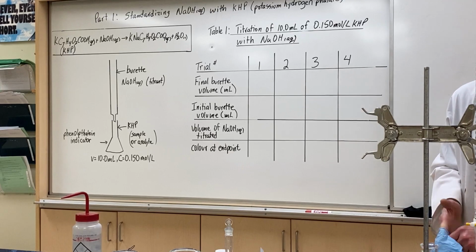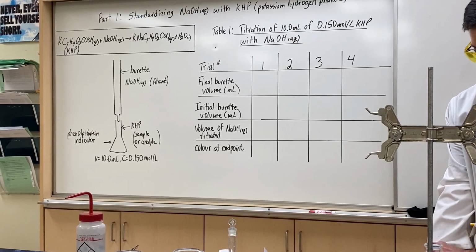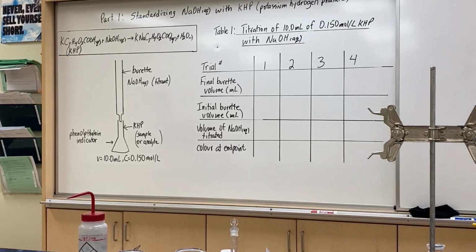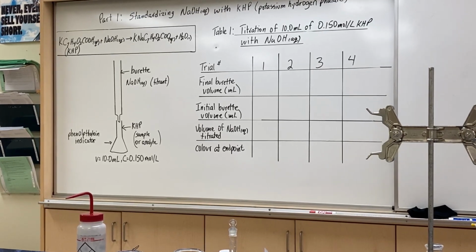Okay, Zdog is setting up and getting himself safe. You will have this exact same graph and chart, and you are going to be following along with us today, filling in the titration table and then doing the math. So we're not putting numbers up there. Well, we might put some up there, but you're going to be doing most of the work.